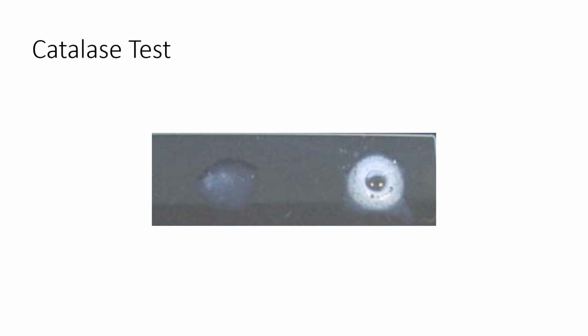So here are two different samples, and you can see in this test, you smear bacteria on the surface of the slide, and then you add hydrogen peroxide to the slide. The presence of bubbles is a positive result. Bubbles means that the enzyme catalase is present, and it's breaking apart that hydrogen peroxide to release a gas. If there are no bubbles, that means it's a negative test result.